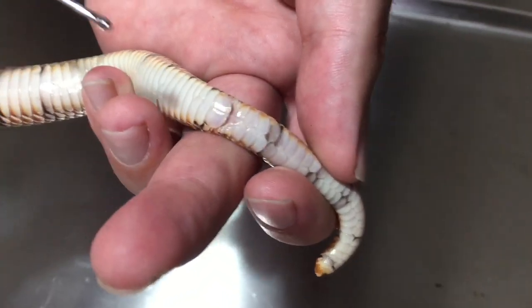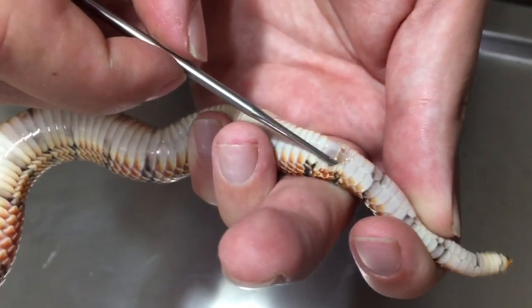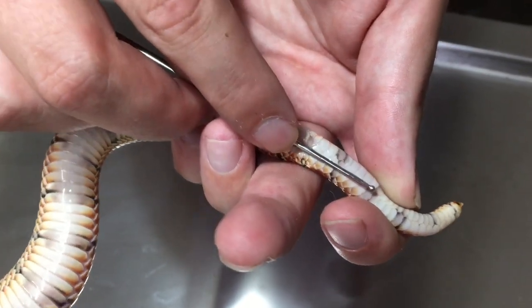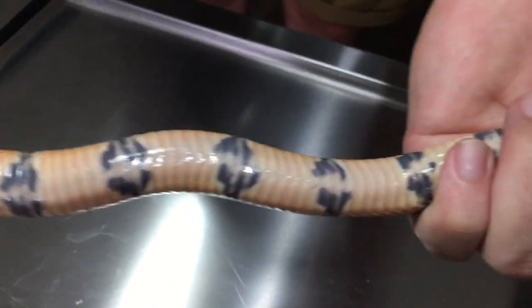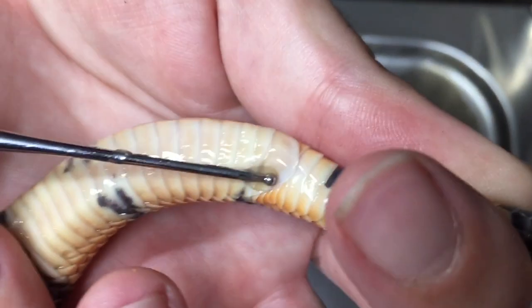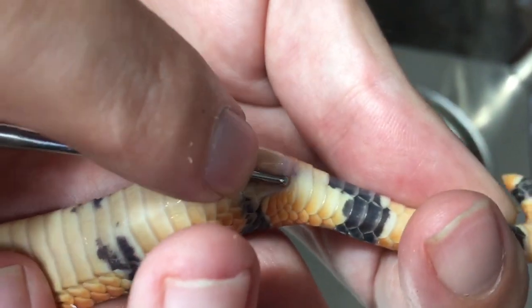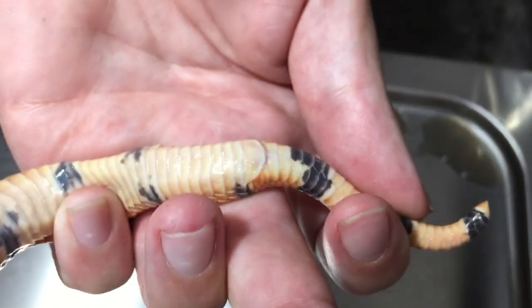Now we probe sex the cape coral — going up the side, gently inserting the probe and pushing it up. This one is going very far — that's nice and deep, definitely a male. We've tubed the other cape coral and let's probe it. The probe is not going any more than that — only a few subcordial scales — so that is definitely a female.